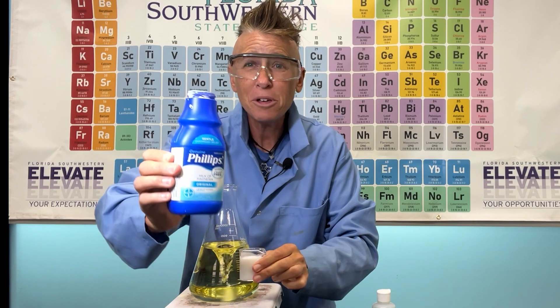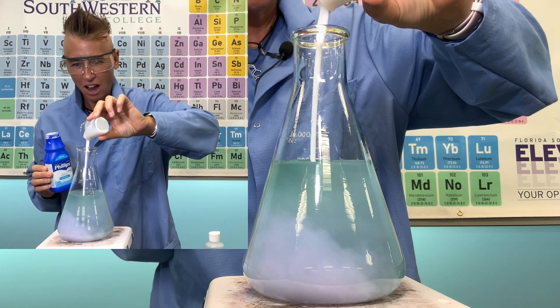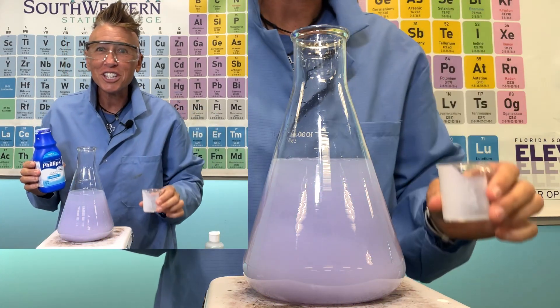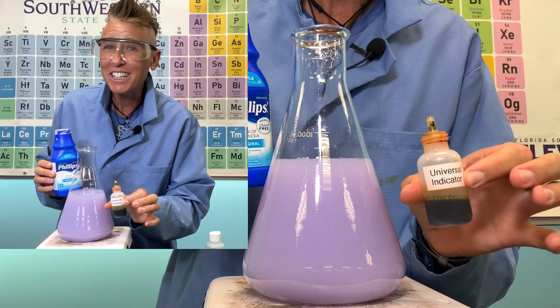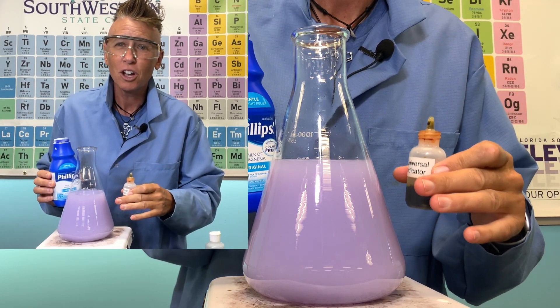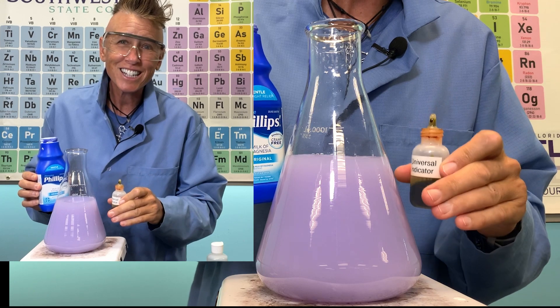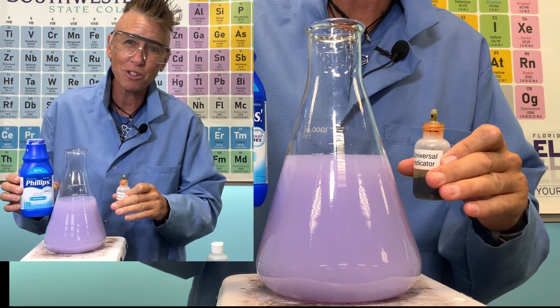Now let's add the milk of magnesia to our water. Do you see that beautiful color change? The universal indicator indicates that this solution is basic, which is alkaline. It's just indicating the small amount of magnesium hydroxide that dissolved in the water.